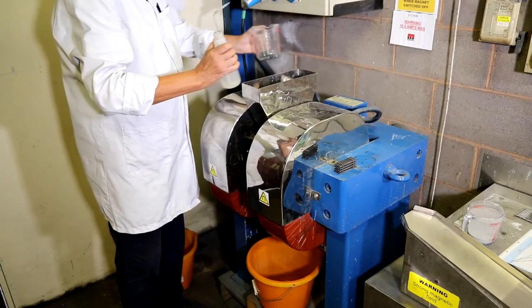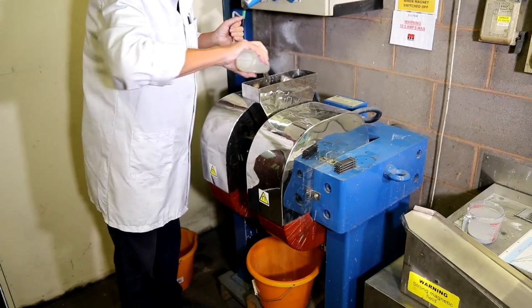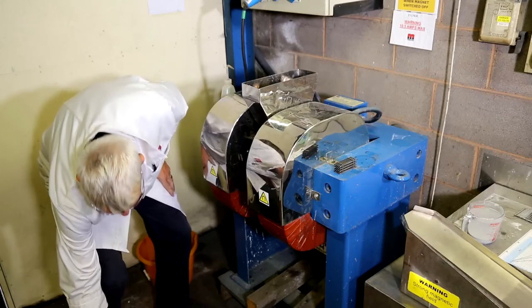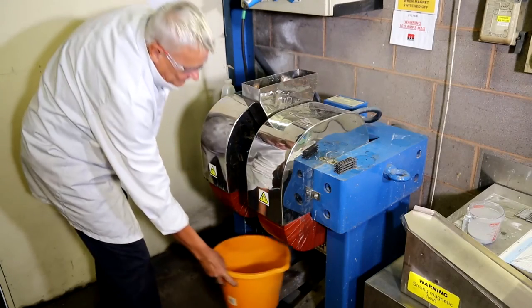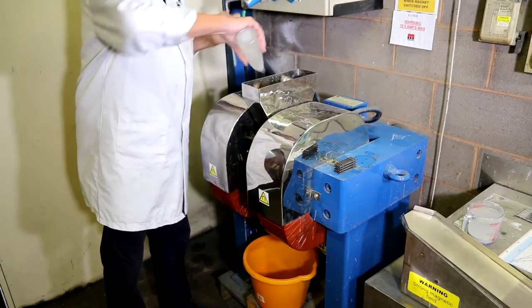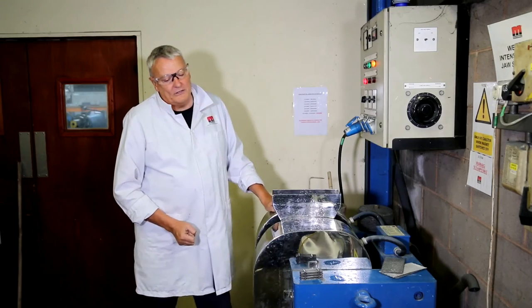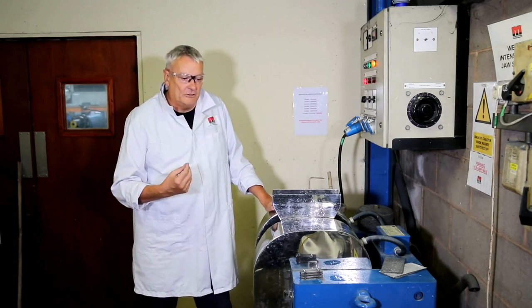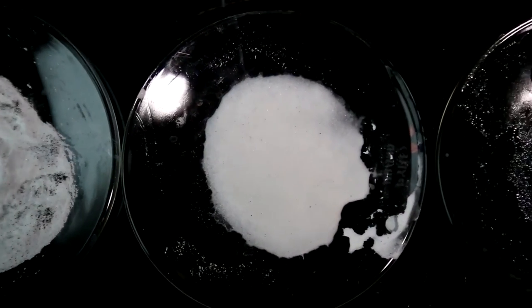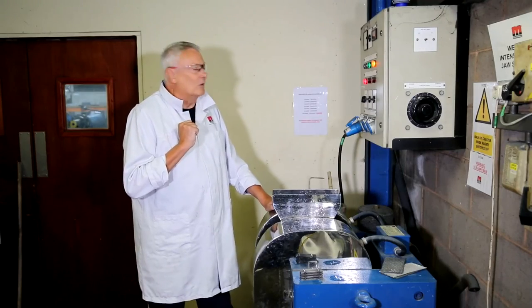We've sold a number of these recently into the university sector and the water treatment sector, where they are used for investigation of different mineral ores and for doing magnetic analysis of a material. For example, if I had a material where I wasn't sure which minerals I wanted to remove from it, I would set my machine at different field strength levels, put the material through, and analyze the magnetic material that comes out using X-ray fluorescence and X-ray diffraction to see which mineral species are separated at which magnetic field strength. That allows us to develop a flow sheet for those specific mineral applications, and that's what we tend to do here quite a lot of the time.